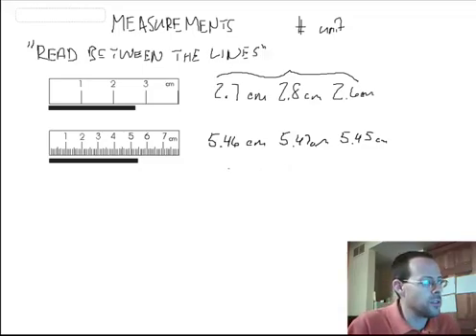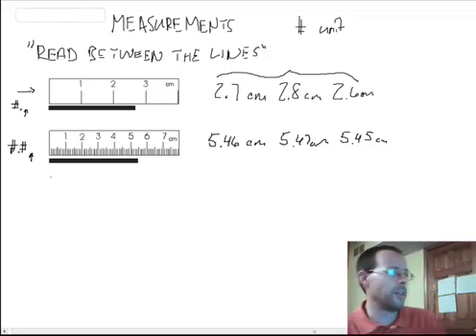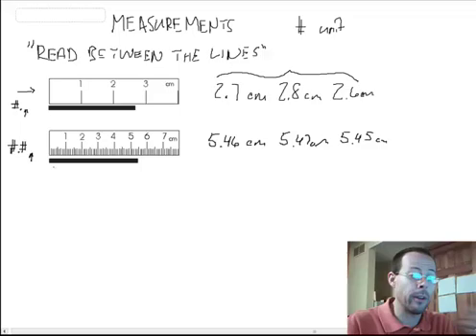All right? So simply, if we just look at this, we know the ones place for sure. So we can estimate the tenths place. Down here, based on this ruler, we know the ones place for sure, because it has lines. We even know the tenths place for sure, so we can estimate the hundredths place. Alright? So just by looking at a piece of equipment, you should be able to tell me how far you can estimate, or where your measurement should take you.